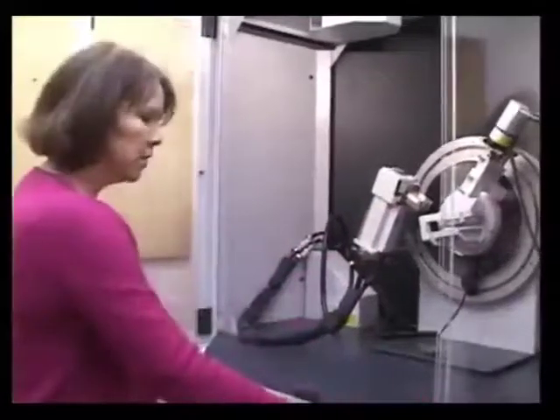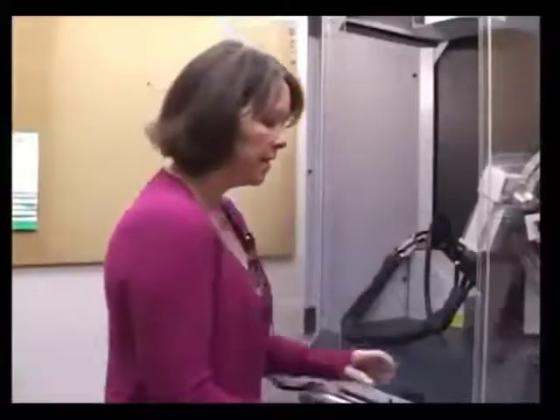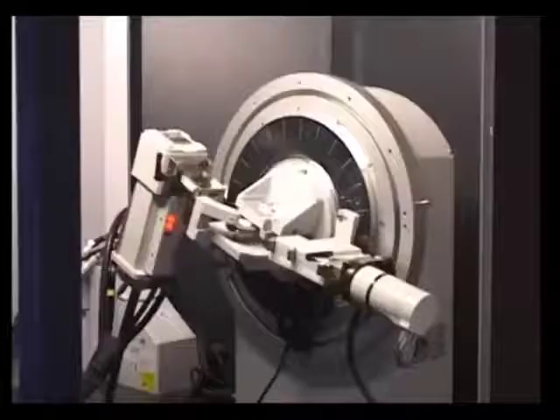The doors are leaded glass and are part of the safety circuit in the instrument. So we are generating X-rays, and those are radiation and could be dangerous. Radiation doesn't travel very far, doesn't travel through thick objects, and it doesn't travel through lead. So these are leaded glass, and they have little pins in the handles that will engage mechanical switches right in here in the door. And then there's also electronic switches in the door in the bottom and the top. What this does is ensure that when you close the door, all the switches have engaged correctly and that the door is correctly closed.